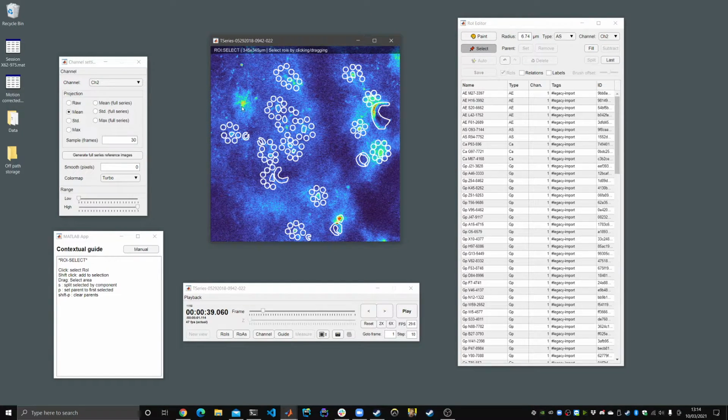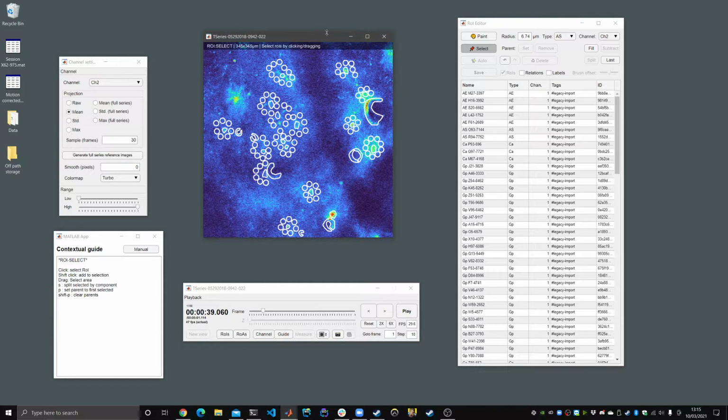So let's say that you have this cell up here and you want to mark ROIs on that cell. Some of the ideals behind this editor is that you can run it primarily from your keyboard, so you don't have to click between the windows. There's also a bug in MATLAB, we believe, in Mac OS, where you have to command click a window to trigger a button when the window is not in the front. This might be something to be considered for Mac users.